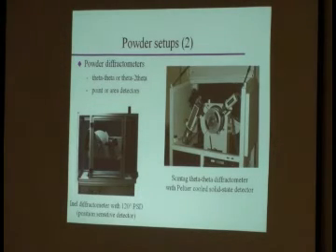How do you do an experiment nowadays? That looks more like what you would see nowadays. You use a powder diffractometer. And there are quite a few options, okay? One of them is what moves on the diffractometer. Do you have a theta-theta or a theta-2-theta diffractometer? Theta-theta means both the tube and the detector move.